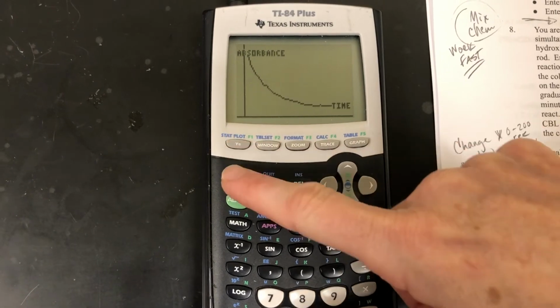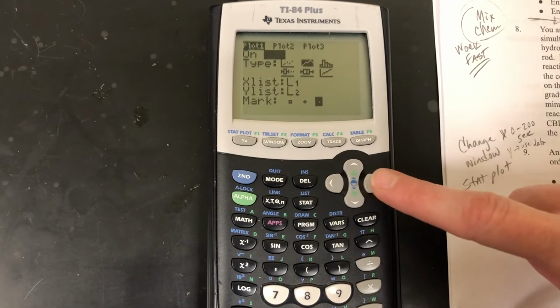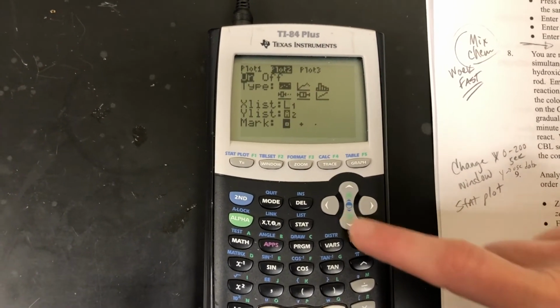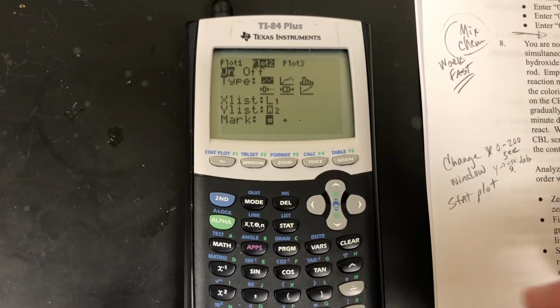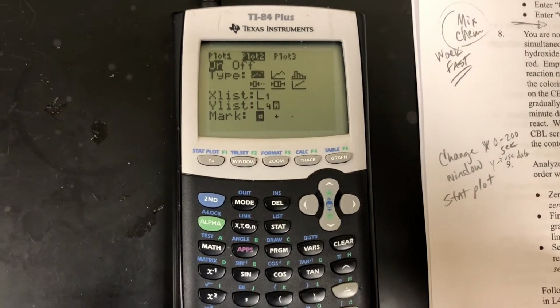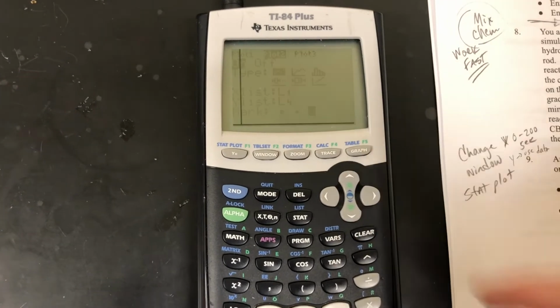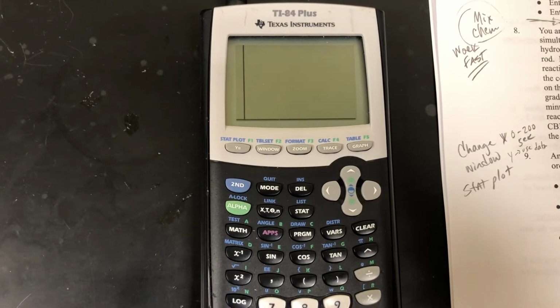So next we go back to stat plot. I'm going to turn this plot off, and then I'm going to go to plot 2, and for plot 2 I'm going to turn it on. And now what I want to do is my time is still in L1, but now my natural log of concentration is going to be in L4. So we're going to type second 4, and that'll give us L4. And I'm going to go ahead and just pick this dot as a mark because it's smaller, so it'll be easier to see. Then we hit graph. It's not working because our window's messed up.